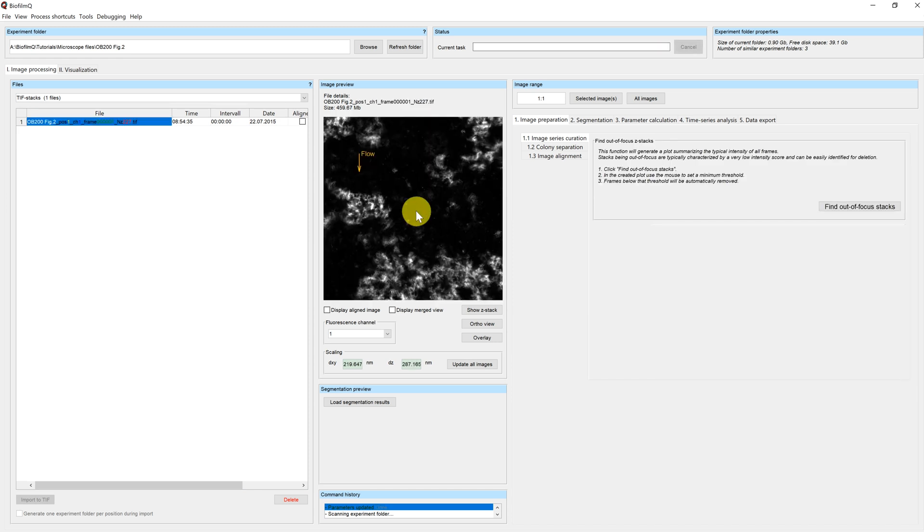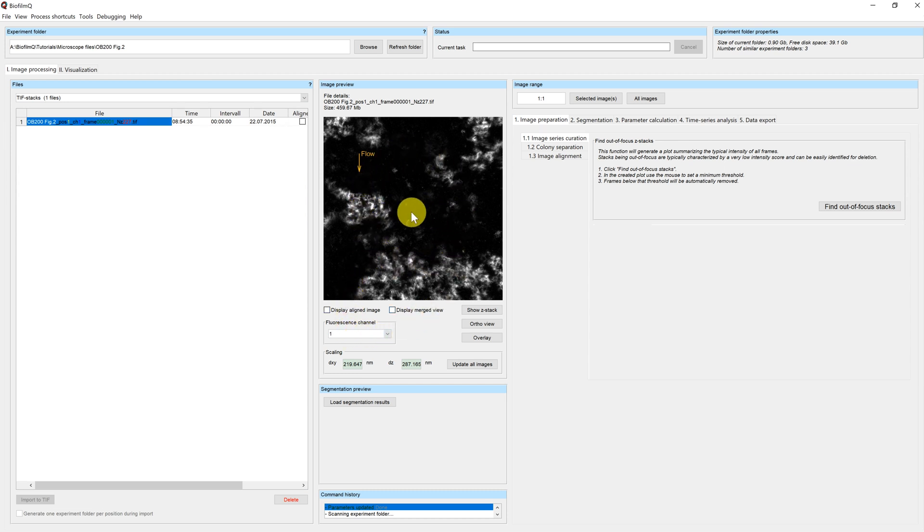So now the new directory has been loaded. You can see the fluorescence channel has been set to 1, and you can see the image preview here. So everything has worked. In additional tutorials we will now be guided through the different processing steps.